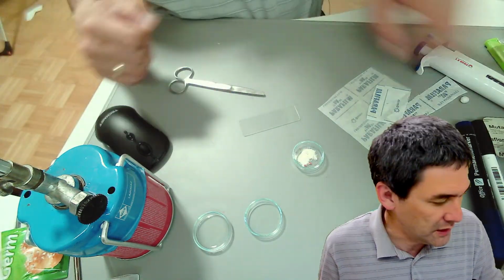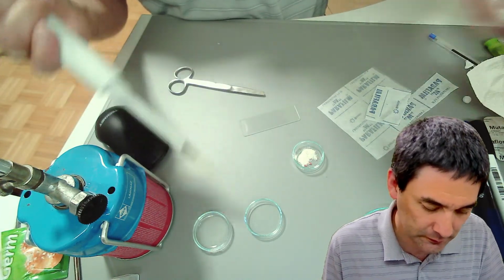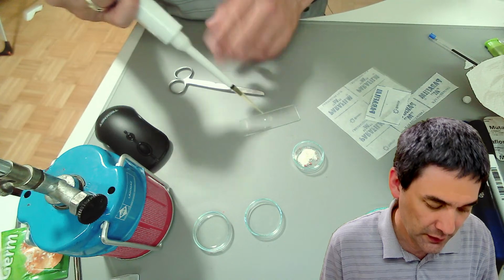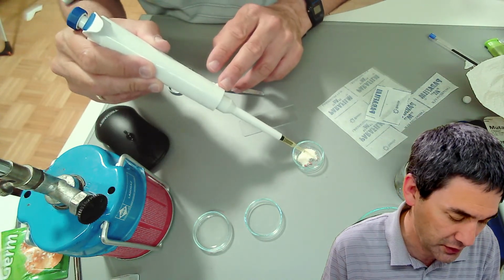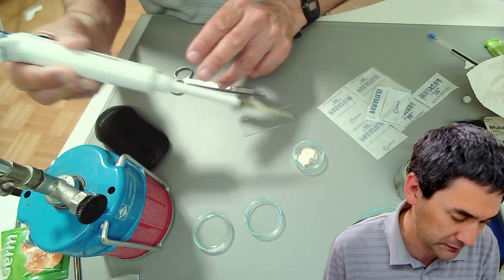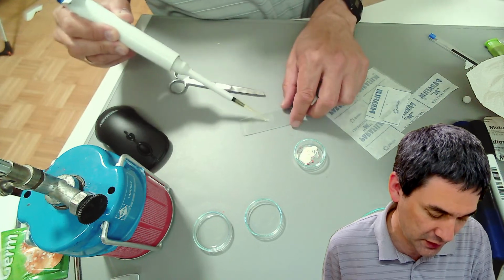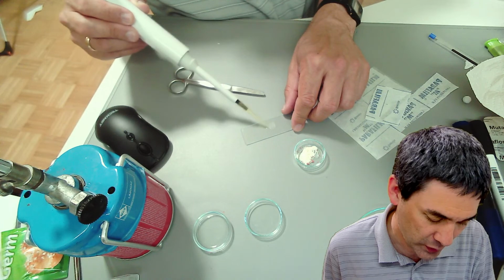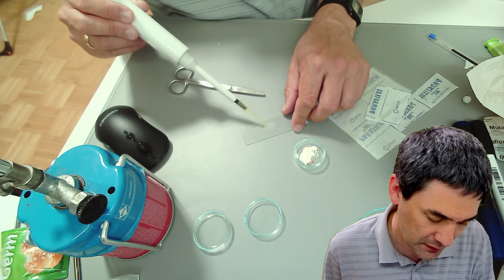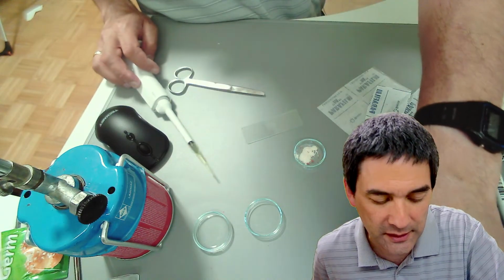So I'm going to take again a little bit of water. Put some water here, and I'm going to do it now a very cheap way. I'm going to dip it directly in here because I'm going to dispose of it anyway. I'm going to transfer some of the bacteria here now into the water. This was a very unprofessional way of doing that. Okay. I'm going to put a cover glass on top, and let's have a look directly.